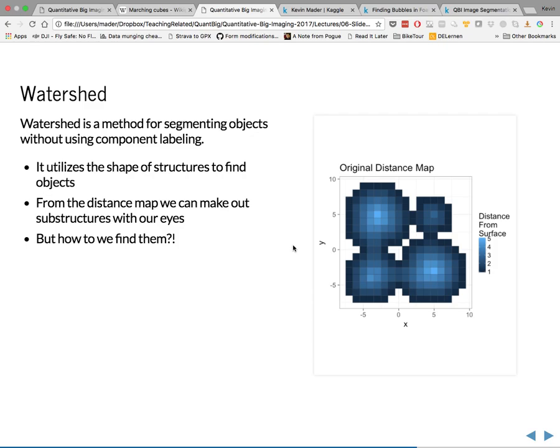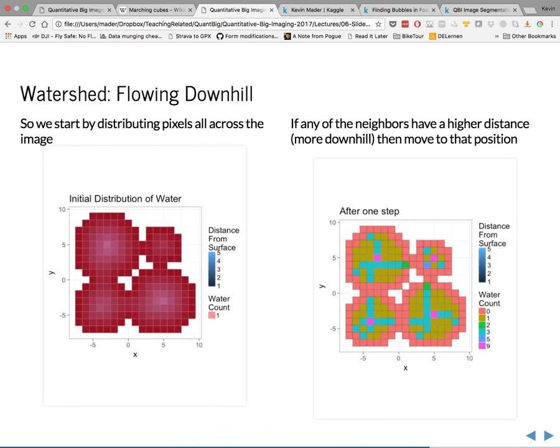If you have a completely mono-disperse substance where everything has exactly the same radius, then erosion or threshold with a distance map works very, very well. But when you have things that have very different radii, it becomes quite tricky because you can't separate them as well as you'd like to, and the rules don't work very well. And so that's where Watershed can be a very useful technique for this.